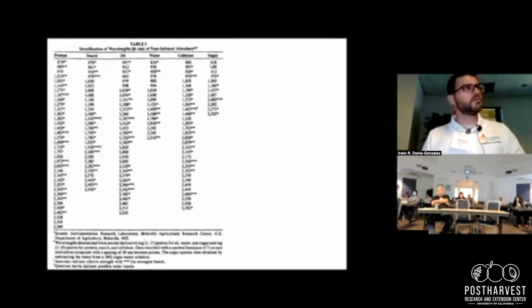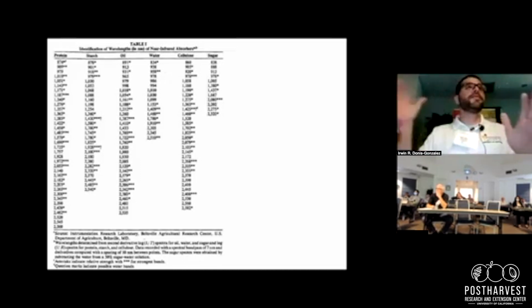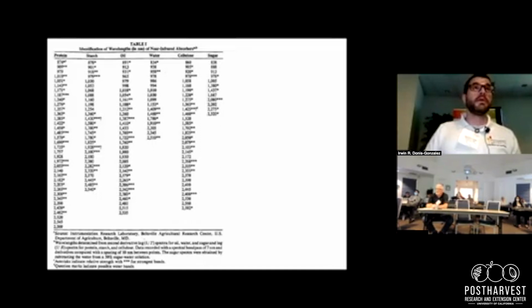Because the sugars absorb beyond that. That's why we say that in many instances, color can change in a fruit, but that doesn't necessarily directly relate to the measurements of sugar. That's why it's not trivial. That's why systems like the ones we're going to see later today are not necessarily just relying on the visible region. They're looking beyond that, typically in the near infrared region, because in the near infrared region we're exciting many compounds of interest: oil, starch, proteins, water for dry matter content. You mentioned dry matter, for example, that it was important as a measurement of quality, like in, what's this, avocados, it is.